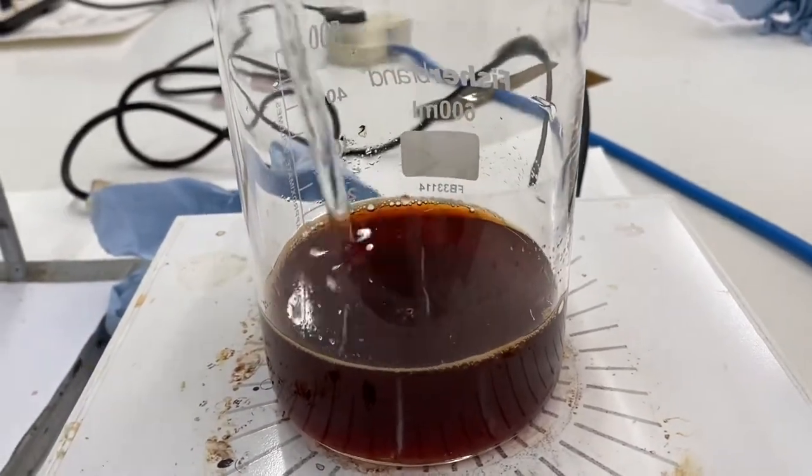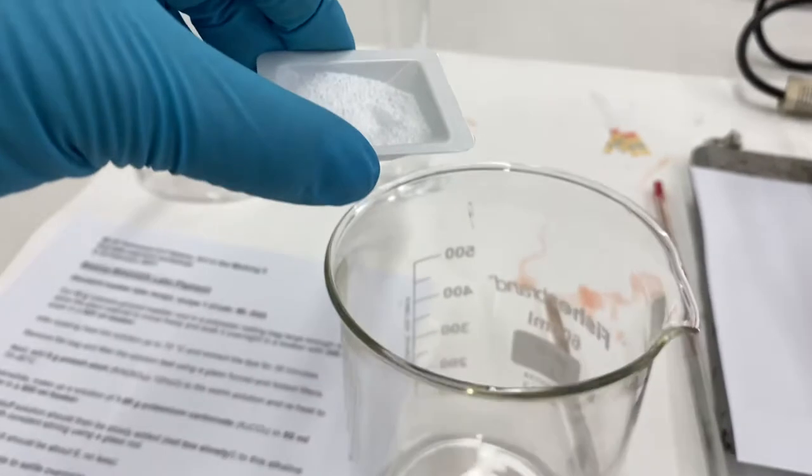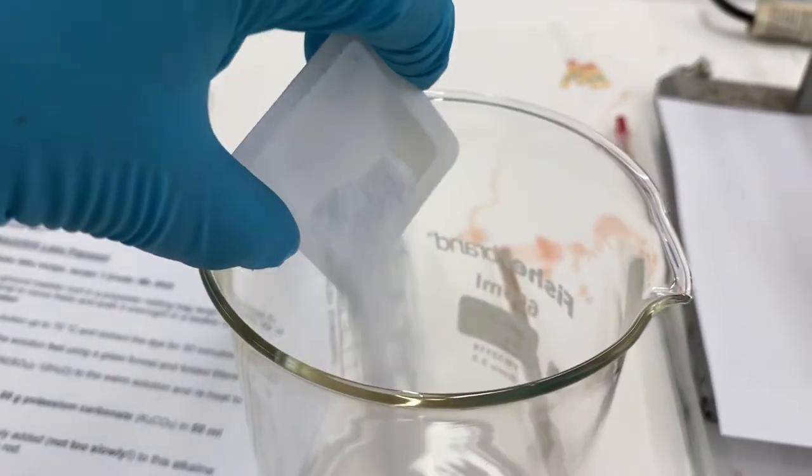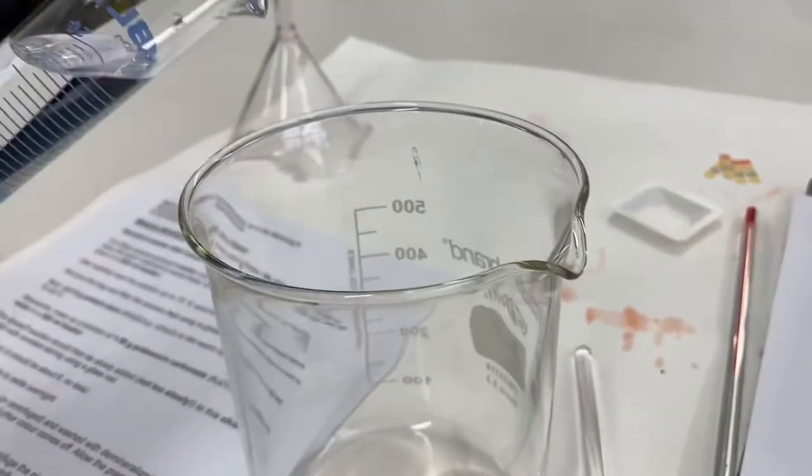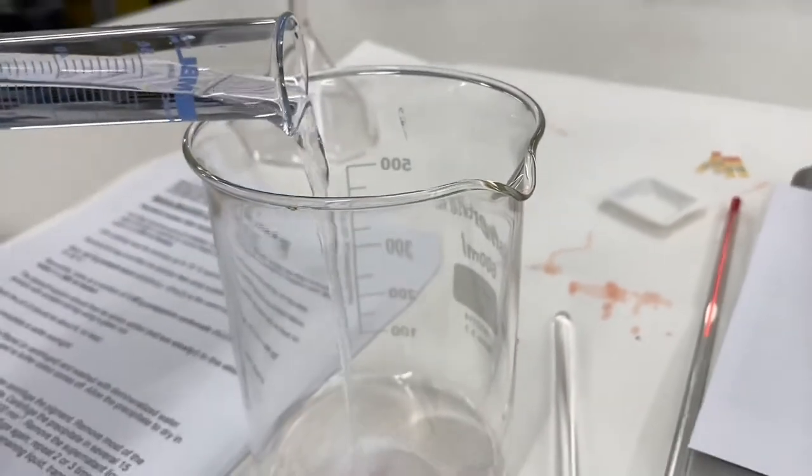While this reheats we add 1.88 grams of potassium carbonate to 50 milliliters of water in another 500 milliliter beaker. This will eventually be added to our dye solution.